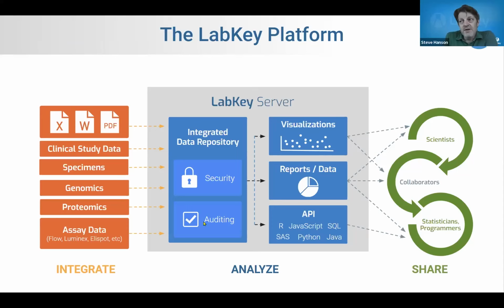The third column in green, these are all the features about sending data out into the world, showing data to scientists, to collaborators and the general public. And in between are all the features of interrogation and reporting. Probably security shouldn't be there, but I don't know how to put security in the third column, so I just put it there.